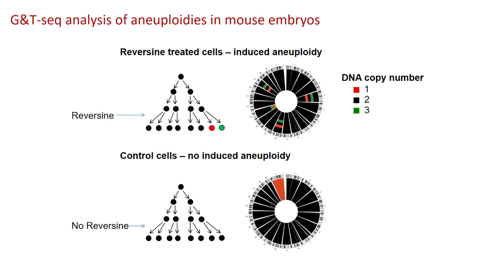We have eight cells on this sort of axis. So just along here, there's 8 cells. And it's just chromosome 1, 2, and so on around. And you can see when we get to chromosome 4, there's a red band and a green band. So it's a cell that has a trisomy and a cell that has a monosomy of chromosome 4.